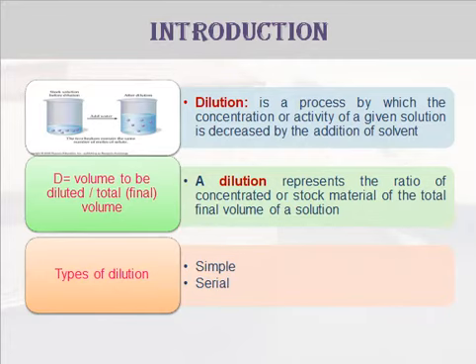The dilution represents the ratio of a concentrated or stock solution, or the volume to be diluted, to the final volume. If we consider the sample or the reagent or the solution to be diluted as a stock or concentrated one, we can express the dilution as the formula: the ratio between the volume to be diluted over the total or the final volume, which is the volume after dilution.